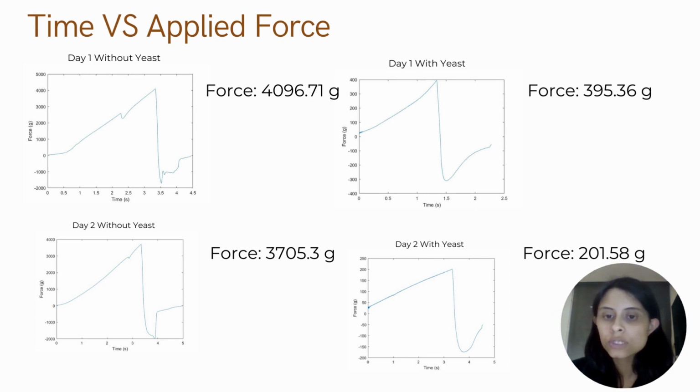Based on these results, this is why fermentation time, or how long a bread dough is left at room temperature, is so important. It is shown that if, for example, the dough was left at rest for 32 hours, the force to resist will be much lower. The yeast dough would already have very small values of strength to resist since fermentation will have already occurred and there will be a greater amount of ethanol and carbon dioxide generated. Meanwhile, the flour and water only dough will also have already lost a lot of strength in its bonds.